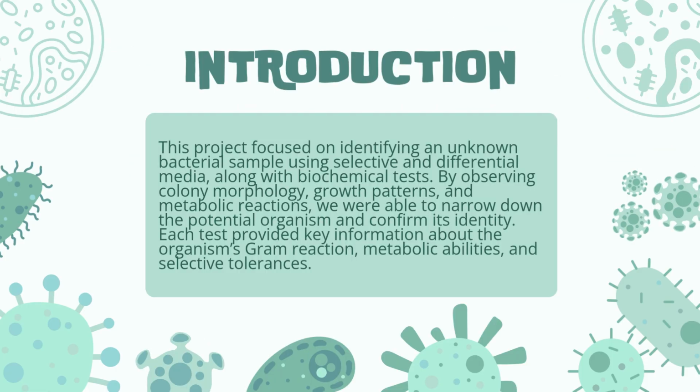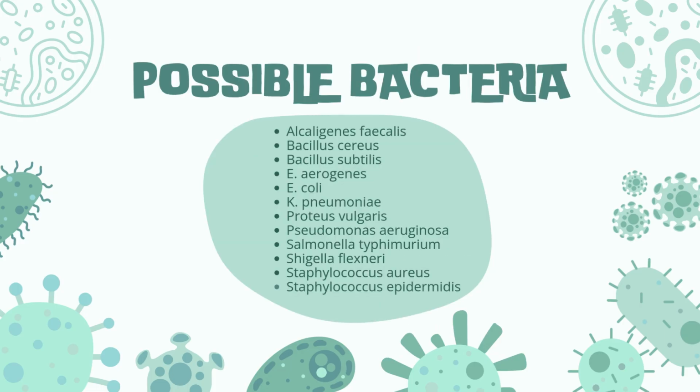The objective of this assignment was to use observational data, selective and differential media, biochemical tests, and microscopic analysis to determine the identity of an unknown sample. At the start of the project, the unknown organism could have been one of several coliform or non-coliform bacteria.